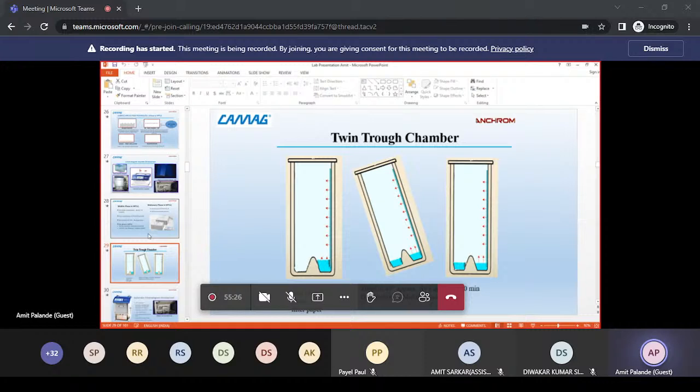So in this module there is one laser light which is monitoring that development, and when it reaches your desired developing distance, automatically that plate will be taken out from that chamber and it will automatically dry, and you can use that for the photo documentation. So a fully automatic developing chamber.